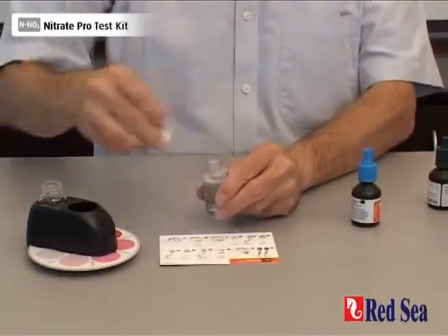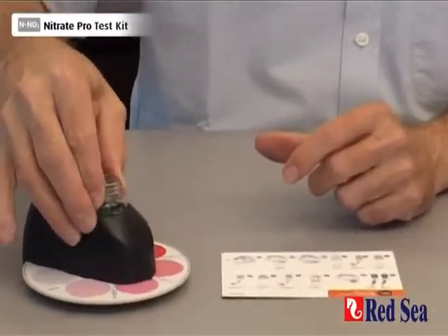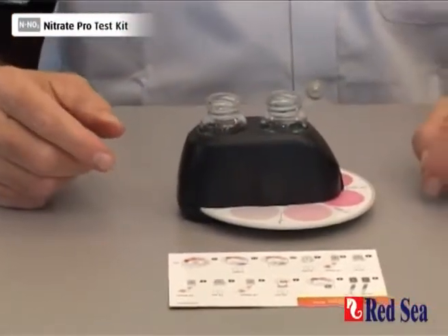When that's done, remove the lid and place the vial into the comparator, and we are now going to wait for nine minutes for the reaction to develop.